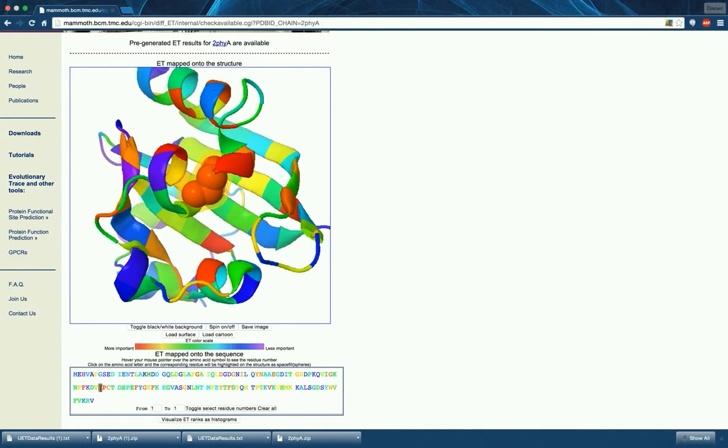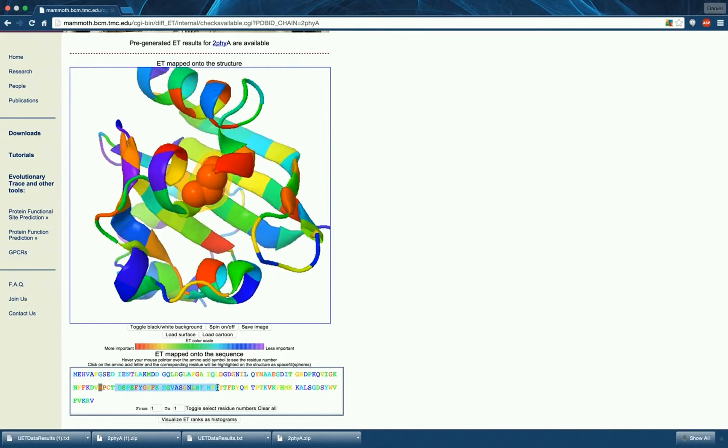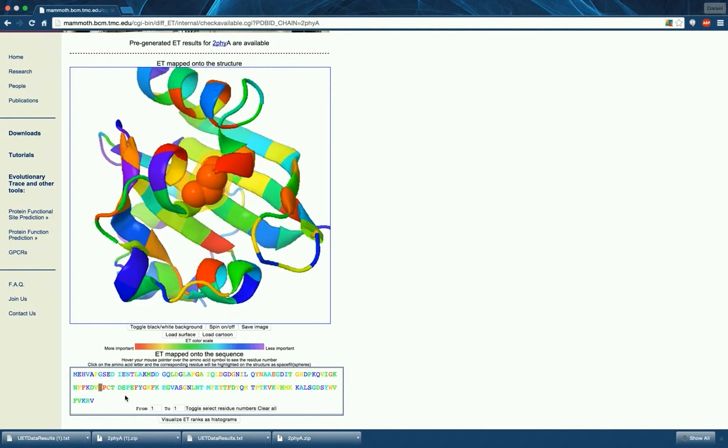Clicking and dragging in the sequence window will not highlight multiple residues. However, filling in the boxes in the bottom of the sequence viewer and pressing the toggle select residue numbers button will select a range of residues.